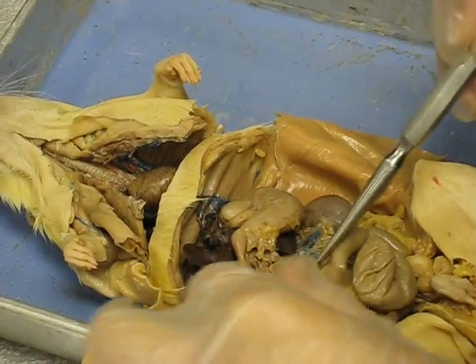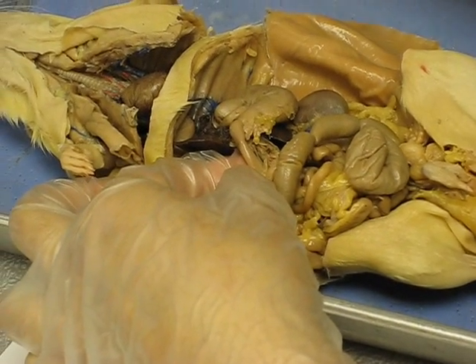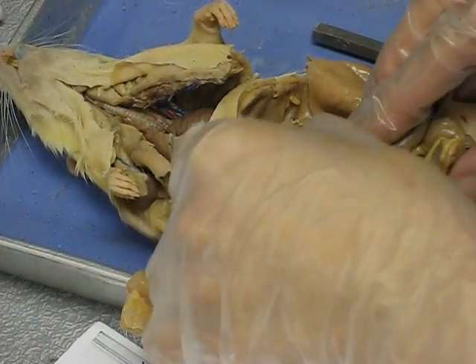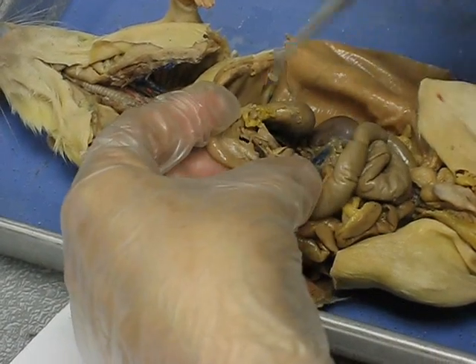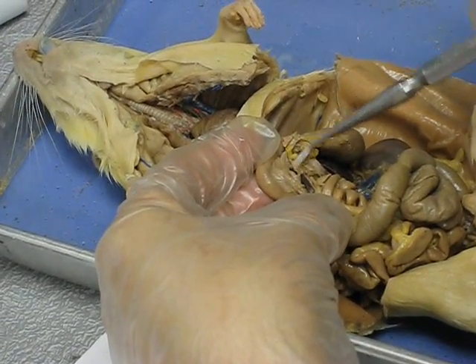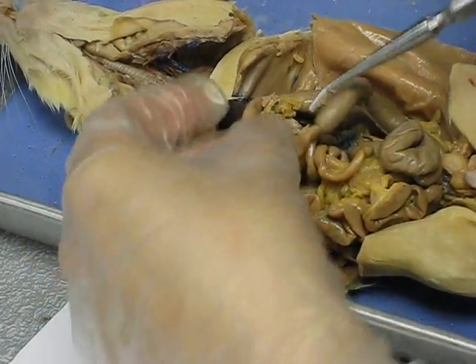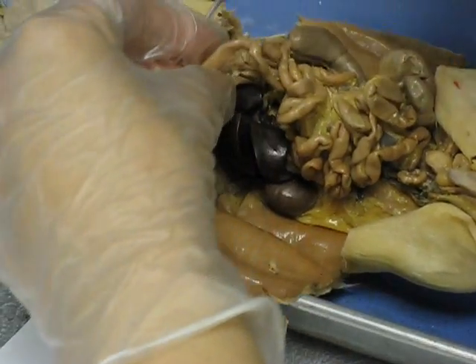Then we go into here. Leading from the stomach, this is part of the small intestine but it has a special name — the duodenum. That's how you'd spell it — duodenum. Within the first turn of the duodenum is this diffuse organ here — this is the pancreas. It doesn't really look like much, kind of like muscle or something.